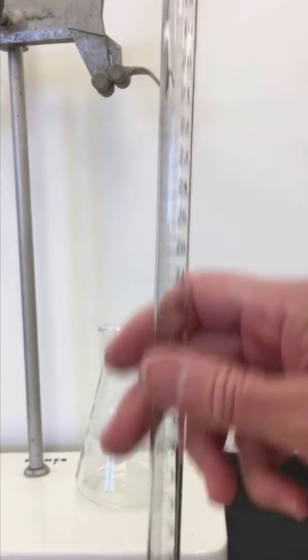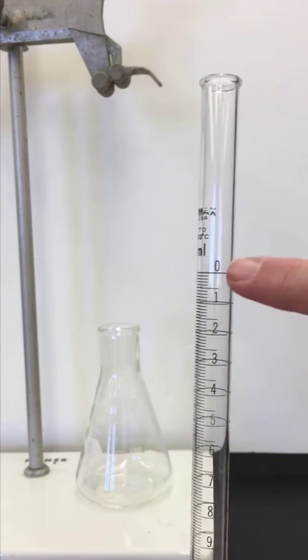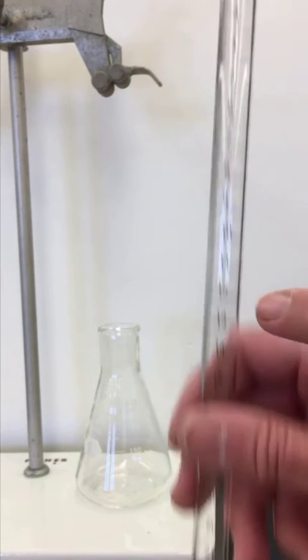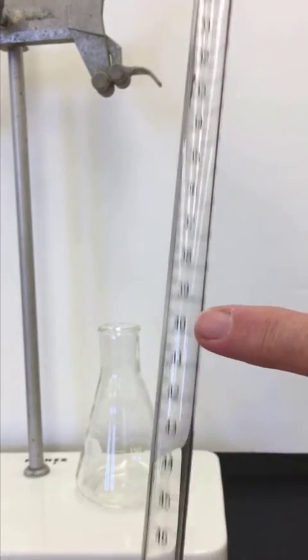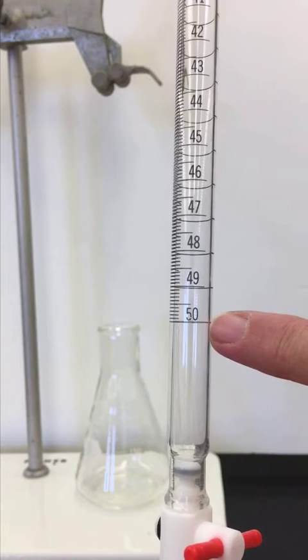On the burette itself, if we go all the way to the top of the burette, the burette is labeled at zero milliliters on the top. It goes all the way down to this burette's capacity of 50 milliliters.